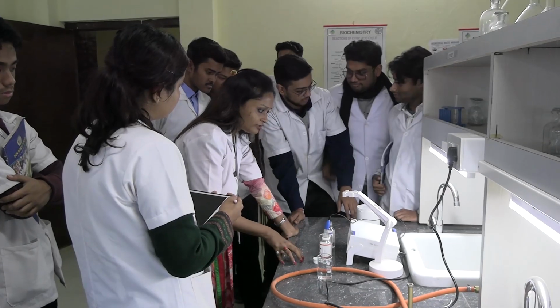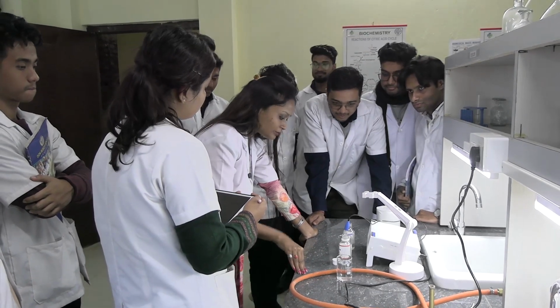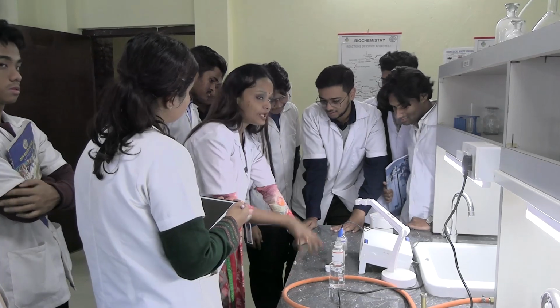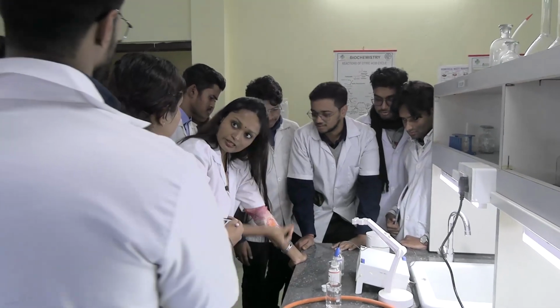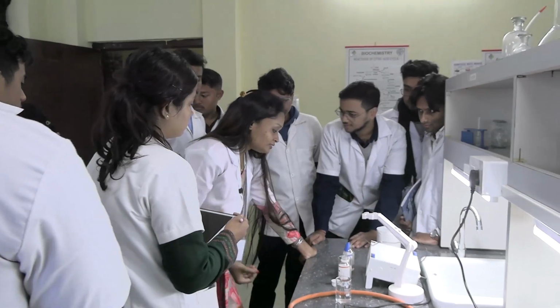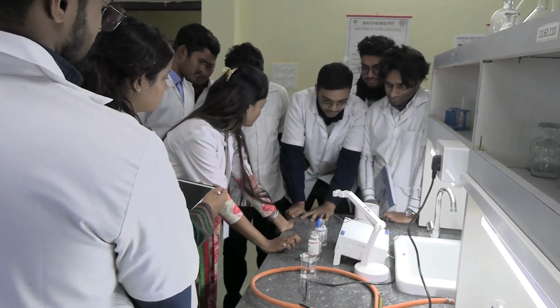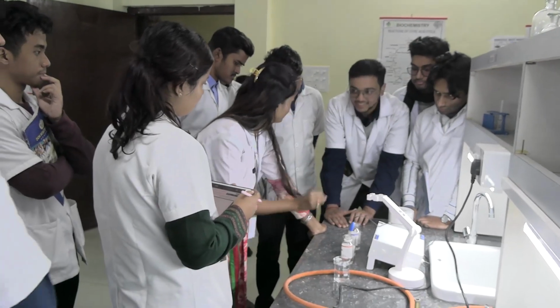With any instrument there is always some error, about 5 to 10%. Also, this solution was prepared a long time ago, in the morning before lunch. When a solution is exposed to air, it comes in contact with carbon dioxide, so it becomes a little bit acidic because of the environment. So it is coming to 11.37, near about 12, but because of its exposure to air for a longer period, it has become a little acidic.